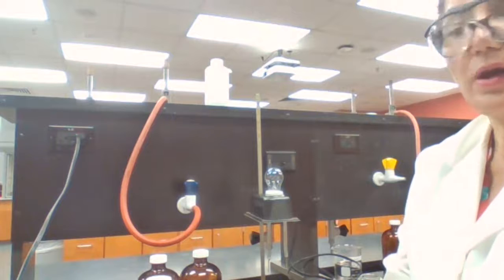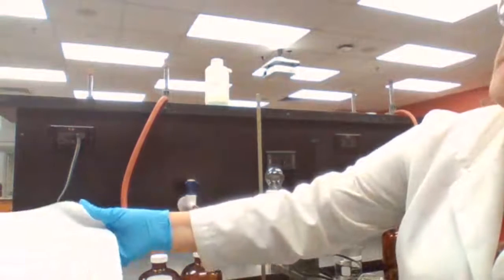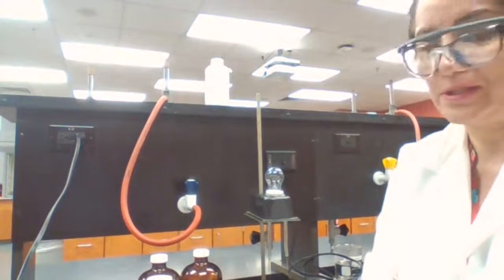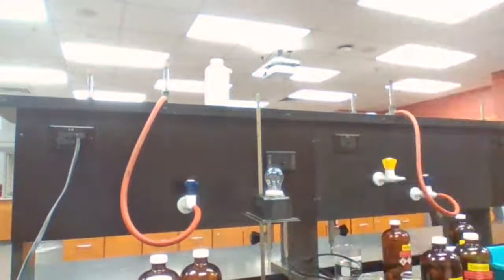Okay, part 2-3. Part 2-3, we have sulfuric acid and barium hydroxide. Each one separately is a strong acid and a strong electrolyte.